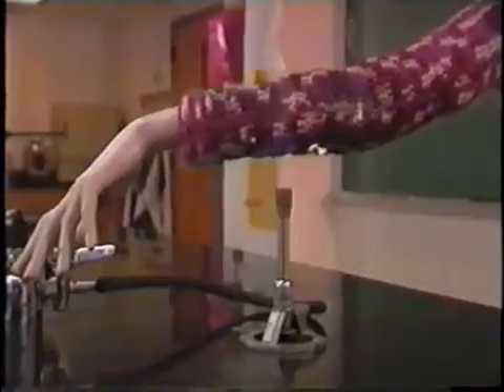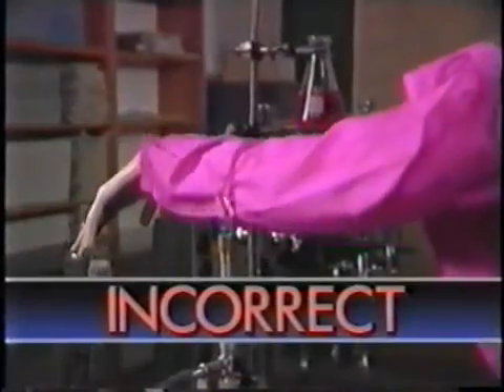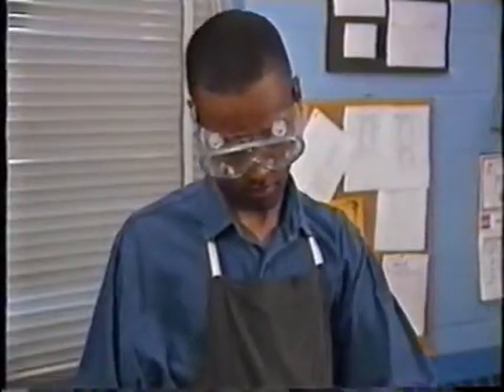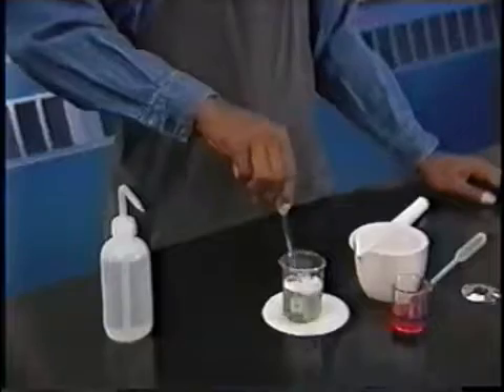The wrong material is also dangerous. As this mannequin demonstrates, fuzzy sweaters or filmy fabrics can easily catch on fire. Synthetics such as polyester melt when they burn and stick to the skin.